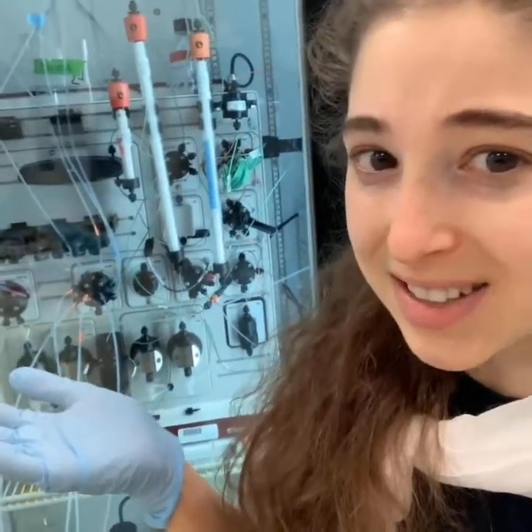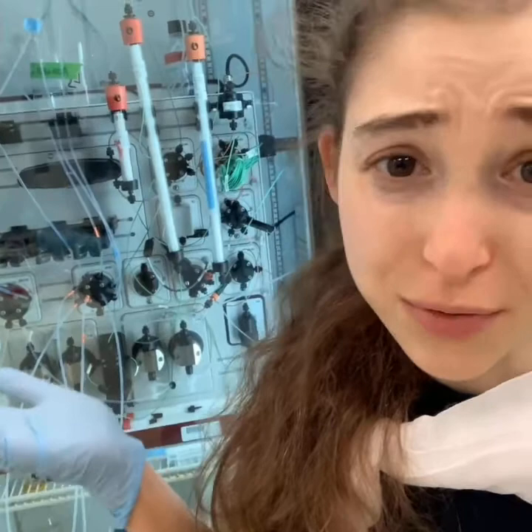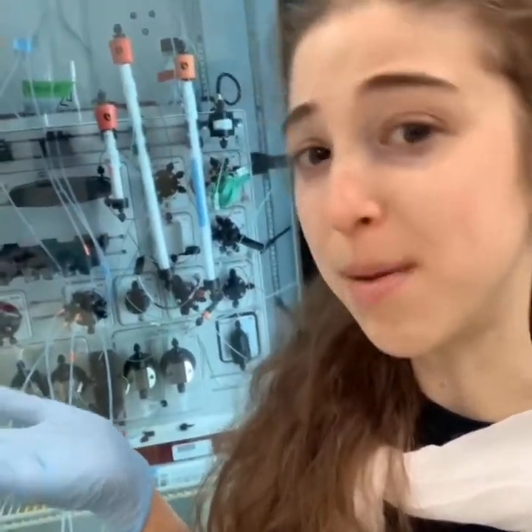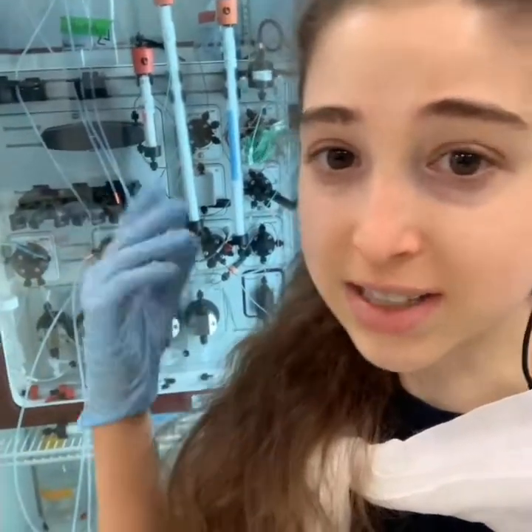Yesterday I talked about using the ÄKTA, but I didn't really introduce you formally. So today that's what I want to do. I want to tell you more about the ÄKTA, which is a machine that we use to help us purify proteins.